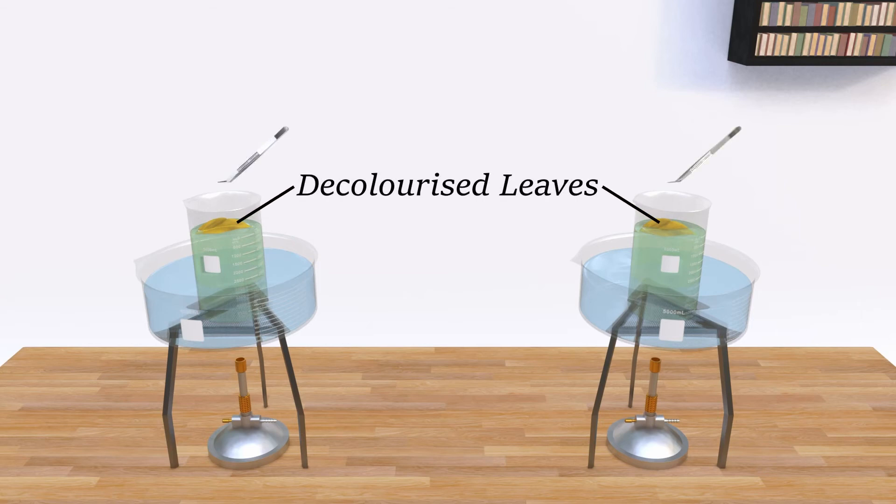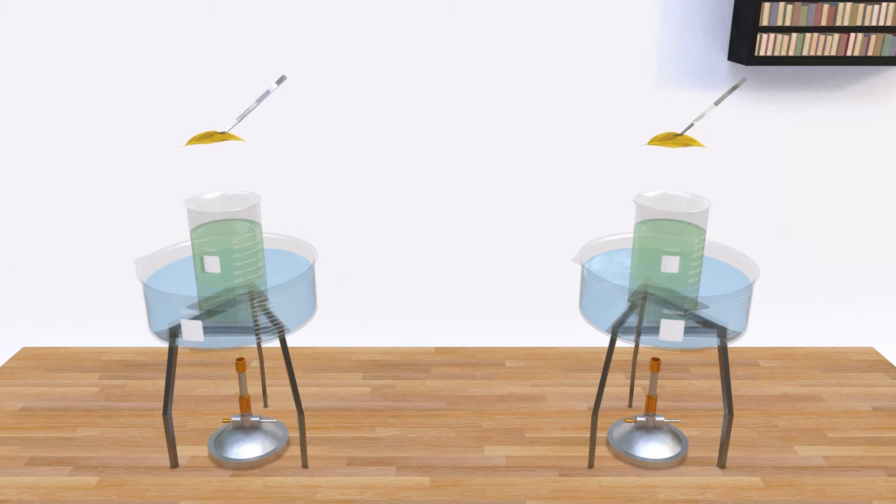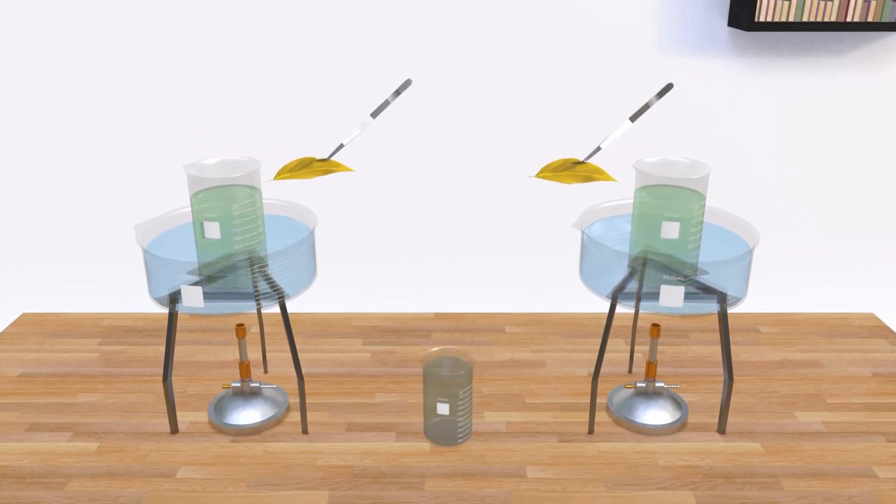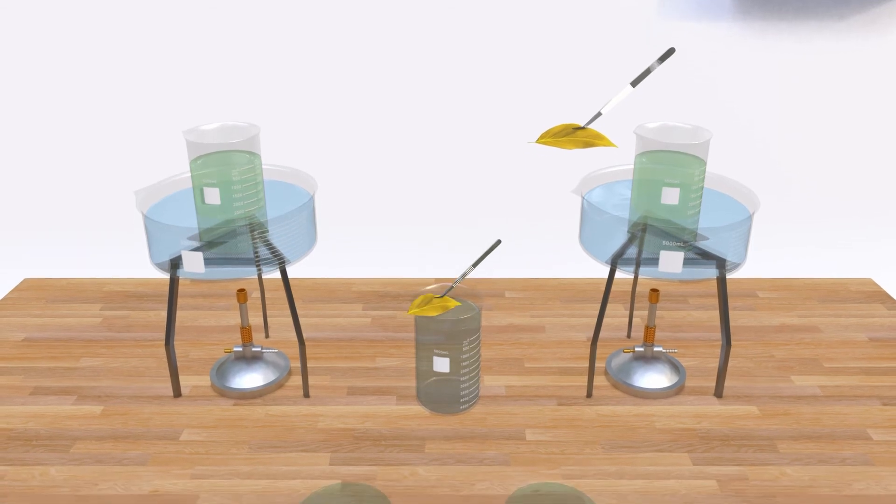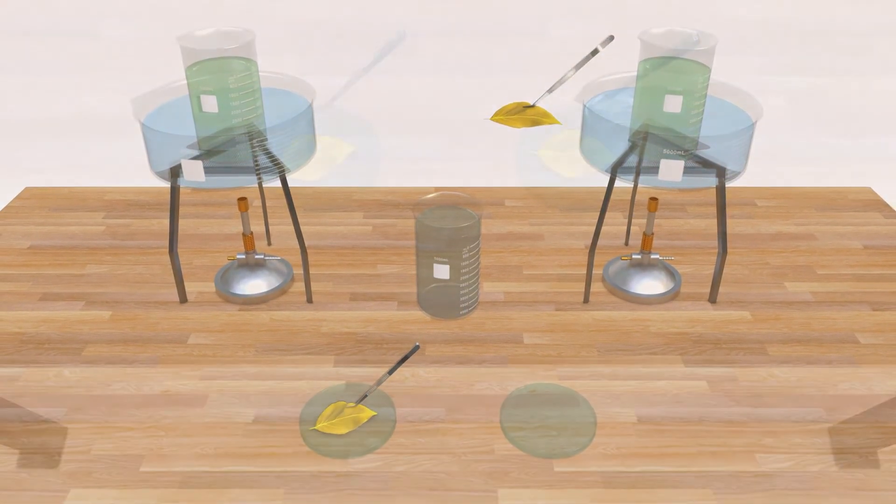Now remove the leaves from alcohol and wash in water so any chlorophyll attached to it is washed off the leaves. Keep each leaf in a separate petri dish.